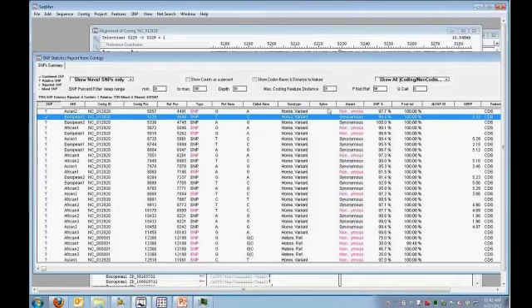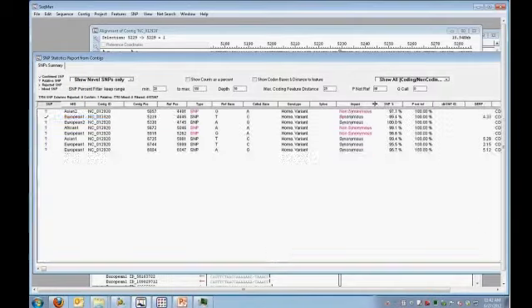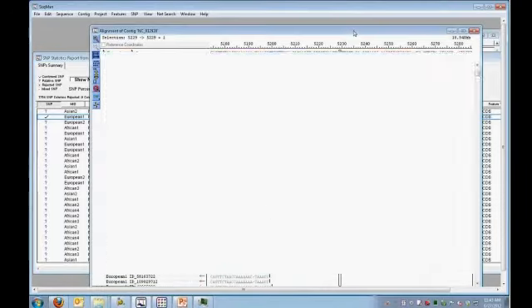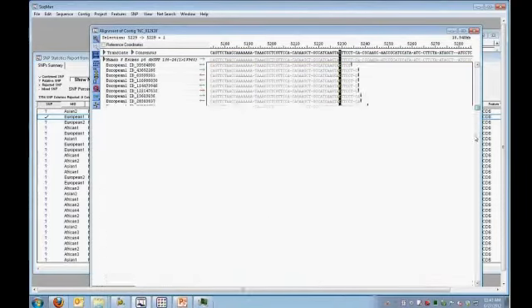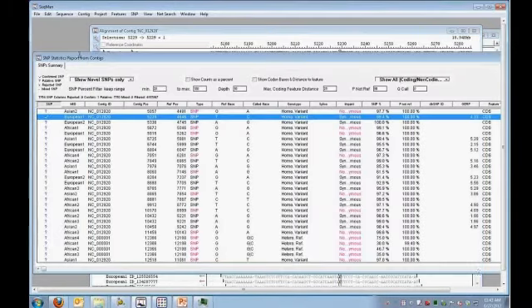intron-exon splicing. I get an impact call on the type of SNP, the percentage that it occurs, then a p-value, the probability that that alignment is not the reference. So in this example, it's almost 100%, so the p-net-ref is going to be 100 because it's such a strong homozygous SNP. Then we also get the dbSNP ID, and I'm just going to scroll a little bit more here.